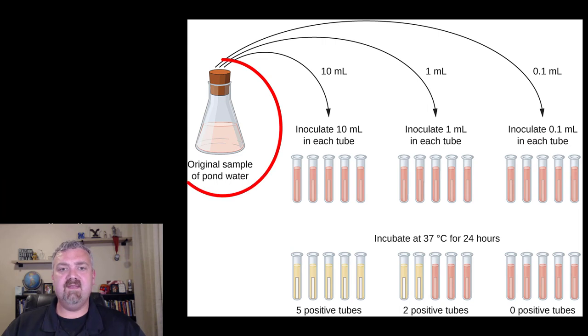Here you see a sample that has pond water and we're looking for coliforms because that tells us there's E. coli there, which tells us that there is fecal contamination in this water.